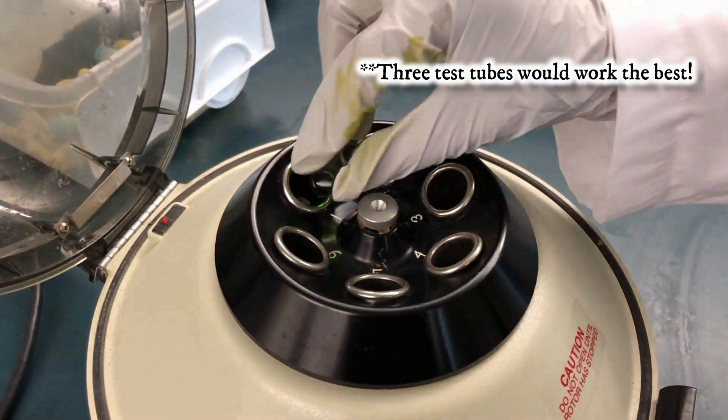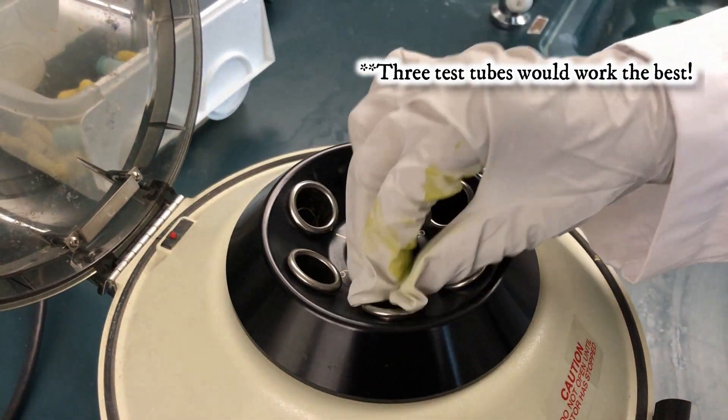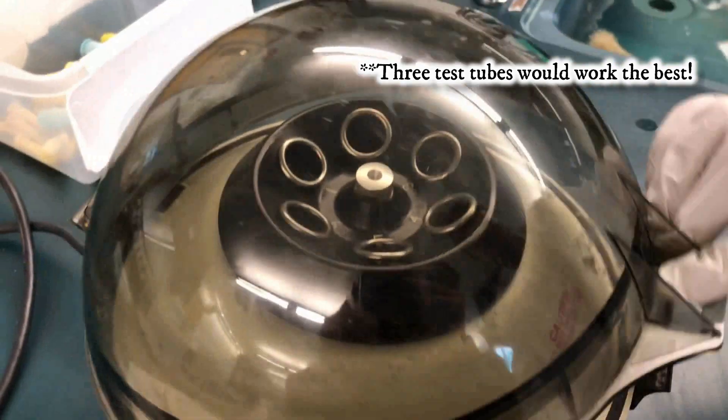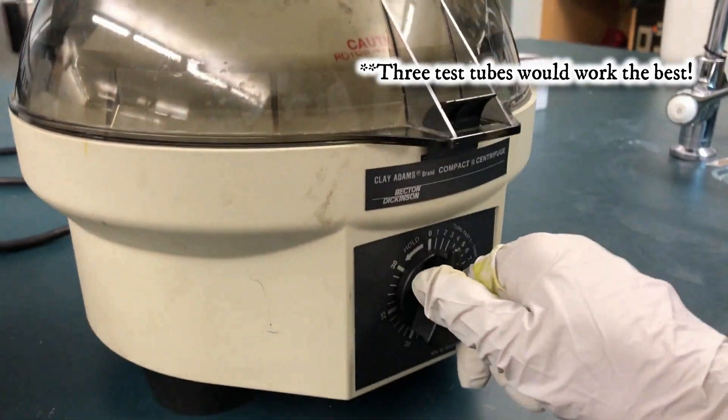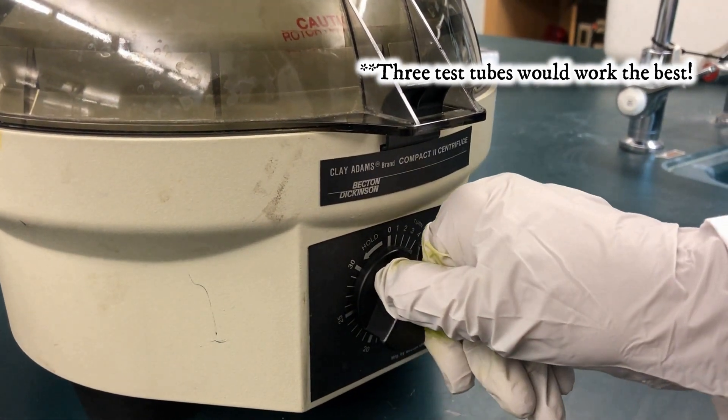Next, centrifuge for about 1 minute to separate the layers. Remember to balance the centrifuge with another test tube of equal mass or volume opposite of your test tube.